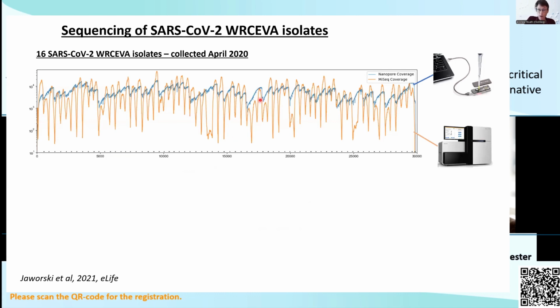And so during the pandemic, we received a grant from the CDC to deploy this approach to study SARS-CoV-2 in Galveston, Texas. And we started off by sequencing isolates of SARS-CoV-2. We designed around 72 primers that targeted the virus genome, which are depicted along the length of the SARS-CoV-2 genome here. There's around these little dots at the bottom.